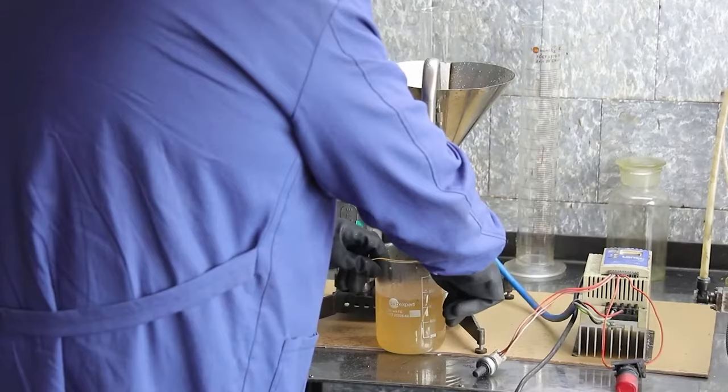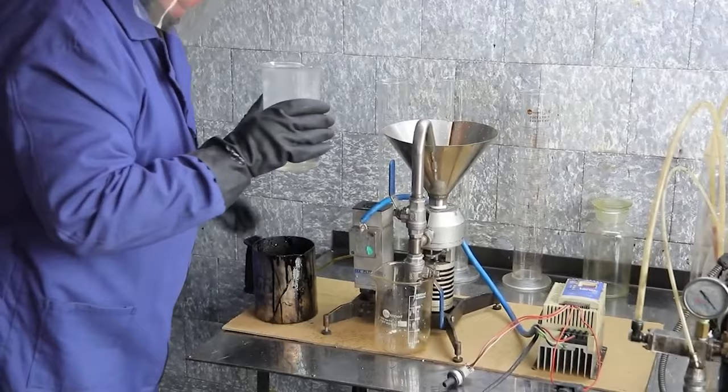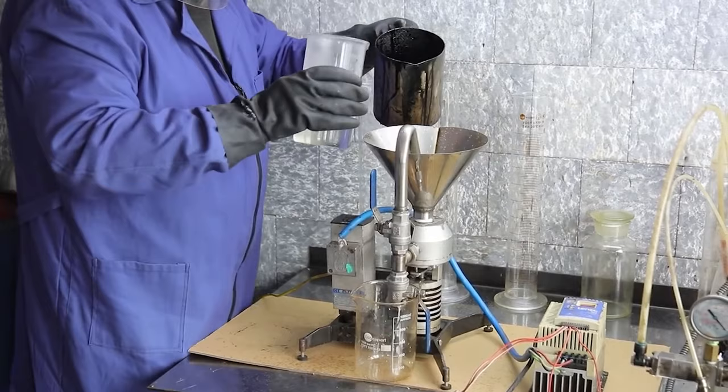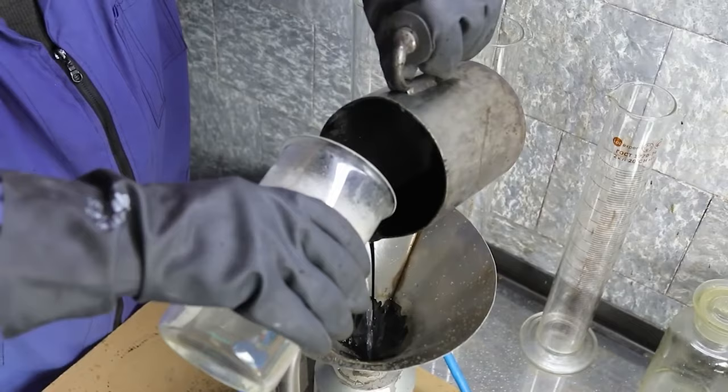Next, we take the bitumen previously heated to 135 degrees Celsius and the blend heated to 60 degrees Celsius. At the same time, we slowly pour them into the funnel of the colloid mill. After these ingredients have passed through the mill, we obtain a bitumen emulsion at the outlet.